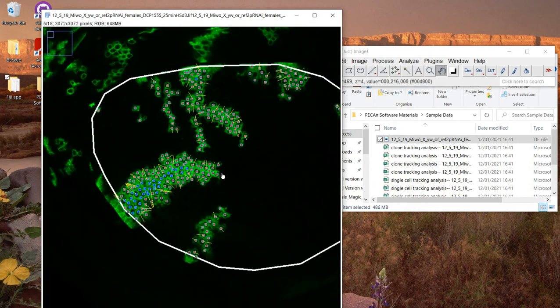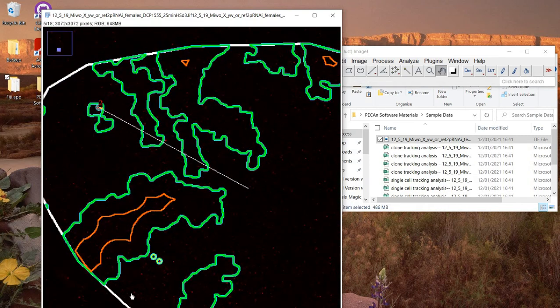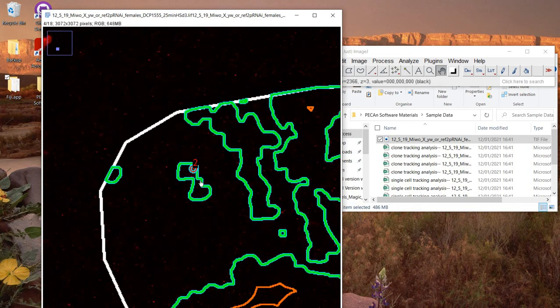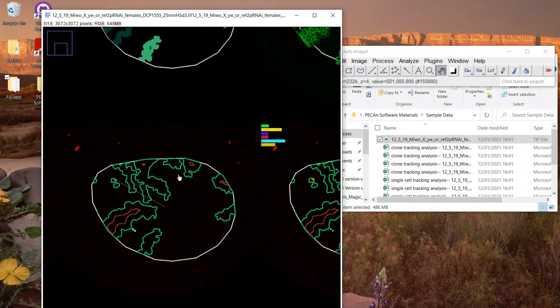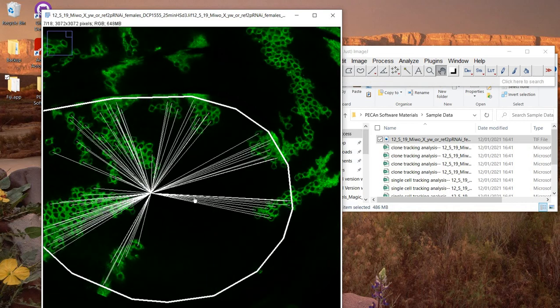And we also did the same thing with our cell death metrics. You'll see that again, these have the yellow measurements covering the distance to the border. There's also a measurement for the distance to the center of the pouch, or the centroid of the region of interest. And we do that as well for the individual cell counts. So for each cell, we've basically got its position, what z-plane it's on, how close it is to the winners, how close it is to the centroid of the pouch, and all sorts of other properties.